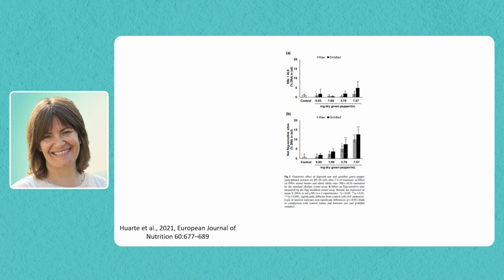We didn't have a clear explanation for that. But in all cases it was a non-toxic concentration, not only in the MTT, but also in the proliferation assay that goes a bit further. It was negative. I was involved in this paper, but it's from another group in my university, and I know they are continuing working on that. They are checking which compounds are produced here that could affect the DNA in that way.